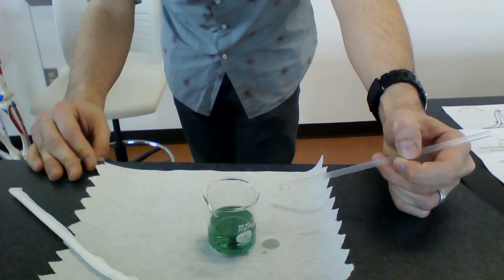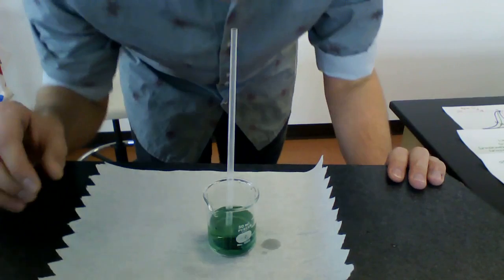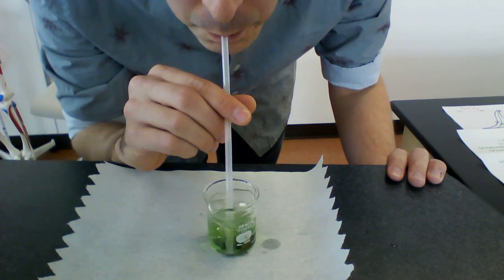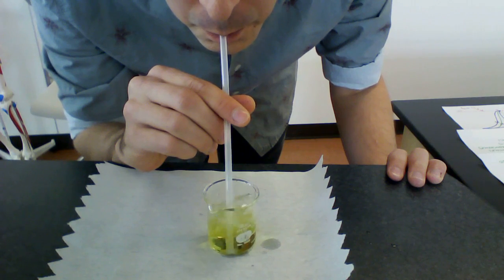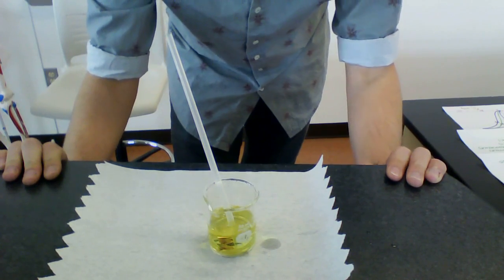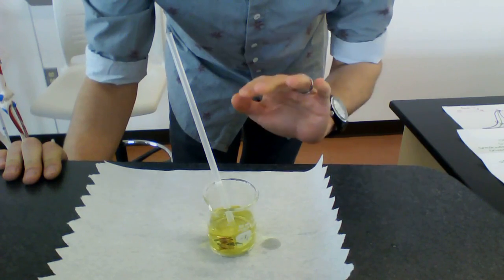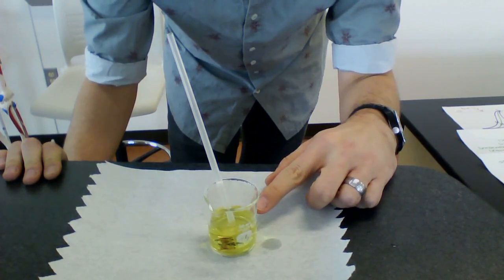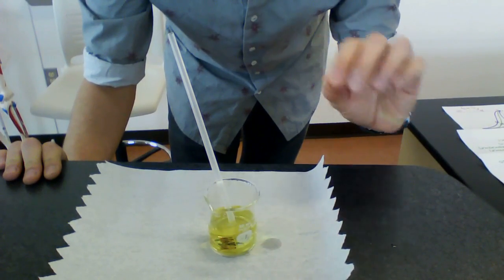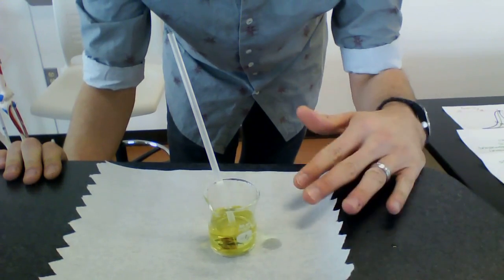And then what I'm going to do is, kind of like when I was a kid, I'd take the chocolate milk and I'd blow bubbles in my milk. And I go like this. And pretty quickly this turned yellow. And it turned yellow because basically I added carbon dioxide to the water, and that reacted with the water, even without the carbonic anhydrase. It became carbonic acid. Then that carbonic acid partially dissociated into hydrogen ion, and that dropped the pH.